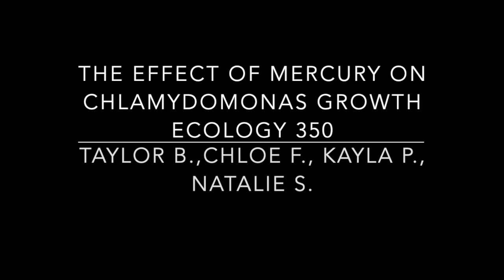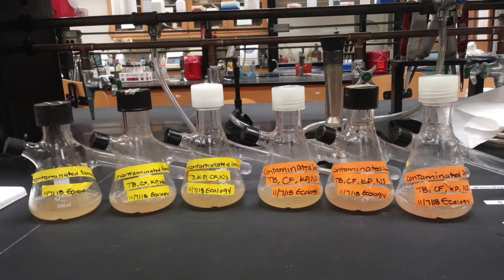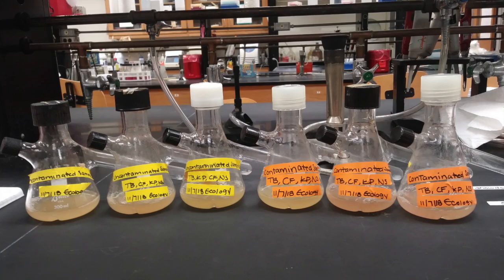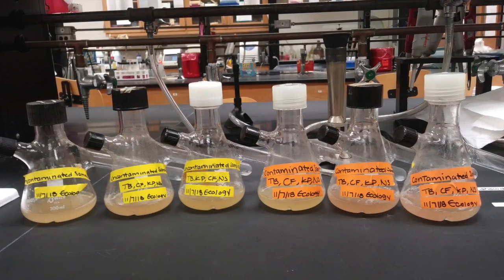Our experiment was to determine the effect of mercury exposure on Chlamydomonas growth. According to a 2015 study by Muhammad et al., mercury uptake by plants, similar to algae, resulted in impairment of chlorophyll synthesis and a reduction of photosynthesis, seedling growth, and germination.